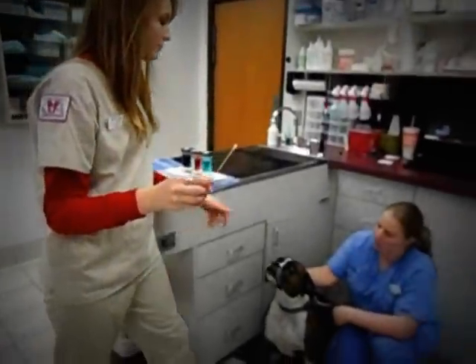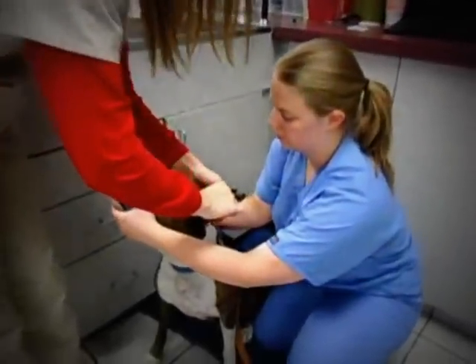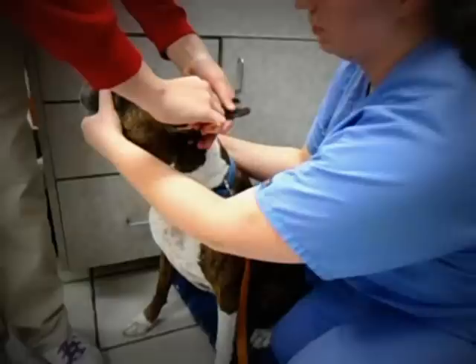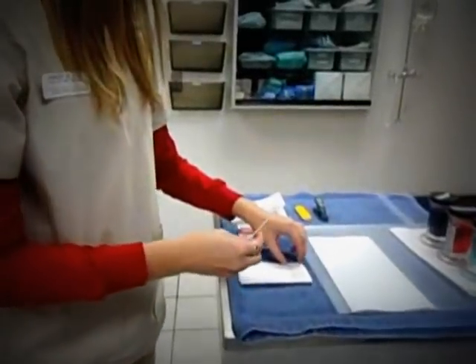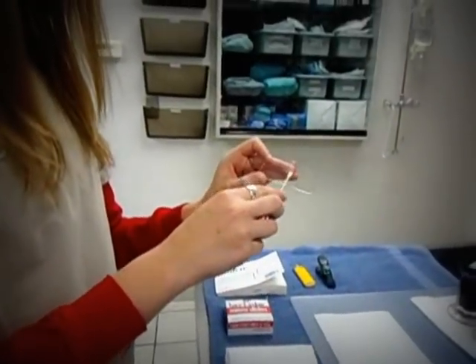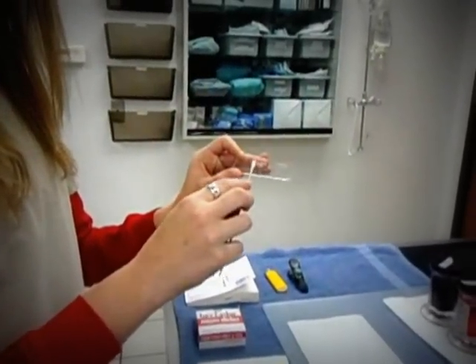Now I take my second swab and repeat the same procedure. I now place the left ear in the middle so that I can easily differentiate between the two ears.